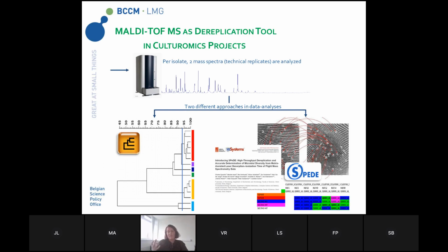It's a different mechanic behind it, based on unicities. So you look at your mass spectra and you go for local and global peak matching parts of your spectra. And if you have a unique pattern there, you call this your reference spectrum.